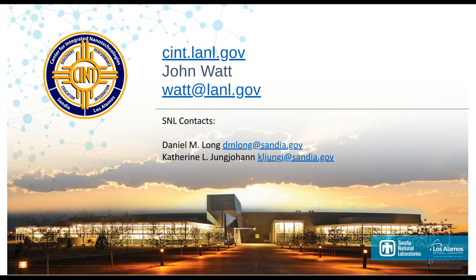Yeah, that's a good question. So it depends on the size of the lamella that you're making. Generally, I make a fairly large lamella, about 20 to 30 microns wide. That gives me a greater opportunity to get a good region of the sample. But I'd say in general, it'll take you the better part of a full workday to make a cryogenic lamella. Whereas in room temperature, you could do that in a morning or an afternoon.